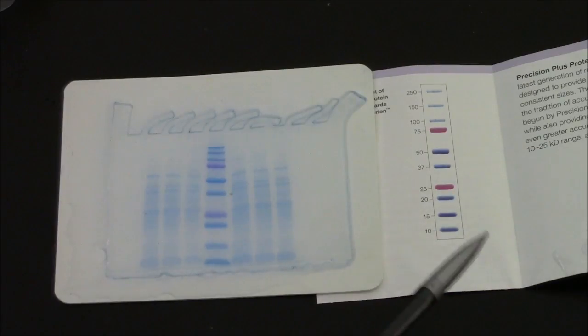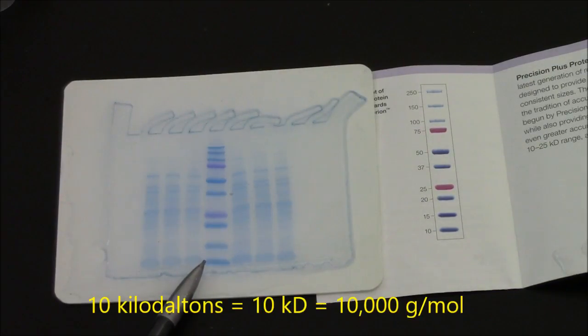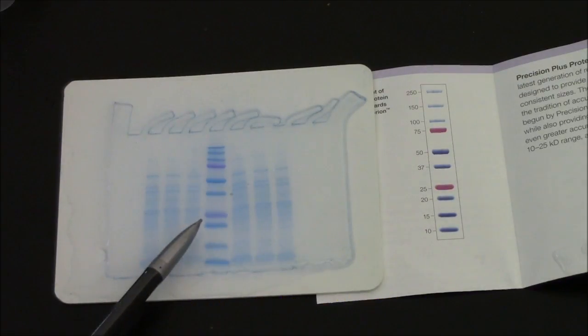Interpretation of the markers is here. The smallest band is 10,000 grams per mole, 10 kilodaltons. 15, 20, 25.